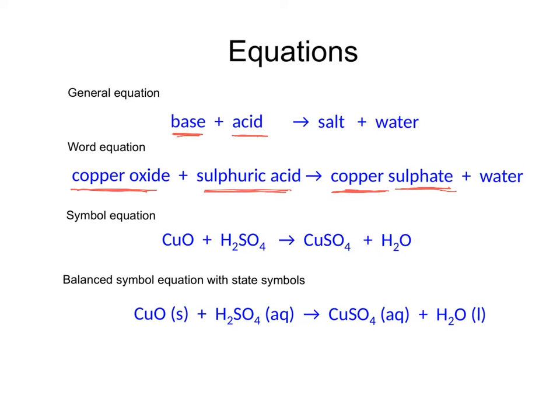It's always very difficult to add just the right amount of a solid to an acid to neutralise it. Fortunately, copper oxide is insoluble, so it forms a solid in solution and doesn't dissolve in water. The only copper oxide that will react with the sulphuric acid makes copper sulphate. Any extra copper oxide won't dissolve, and therefore you can filter off your excess copper oxide once all of your sulphuric acid has been neutralised. All that you've got left in your solution is your copper sulphate and water, and therefore you can evaporate the water to get your copper sulphate crystals.